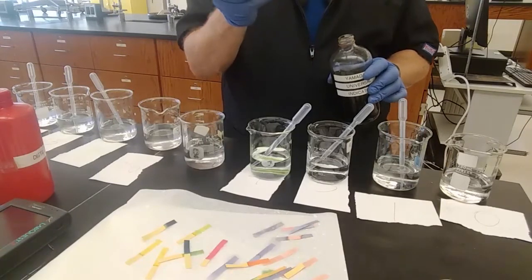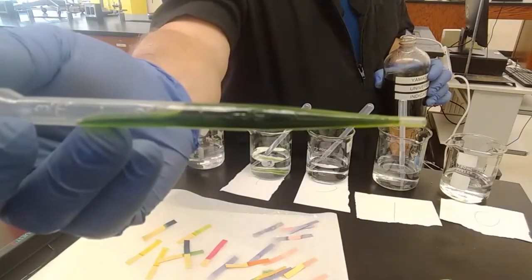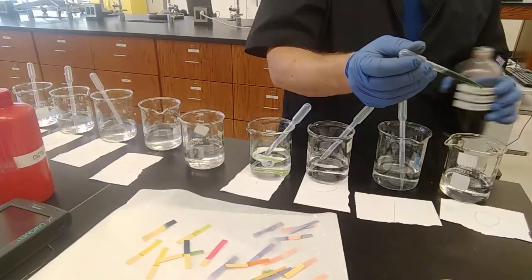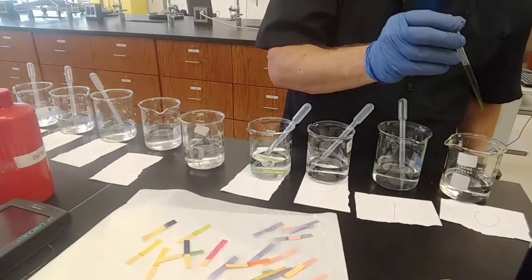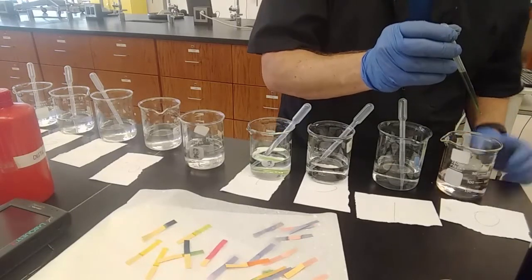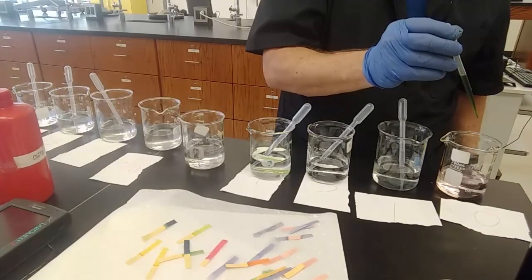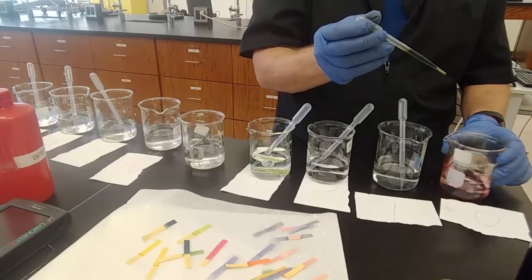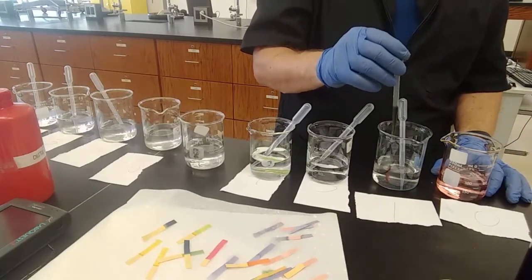So I only need a couple of drops per beaker of this greenish solution as it comes out of the bottle. 1, 2, 3, it's really light if I do that. 4, 5, 6, 7, 8, 9, 10, 11, 12, 13, 14, 15, 16, 17, 18, 19, 20. So let's call it a milliliter that I'm going to add to each one.